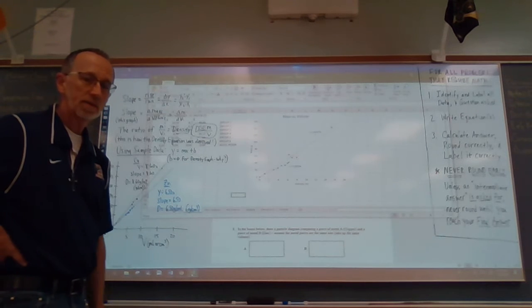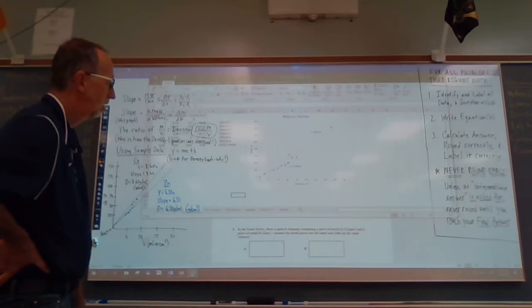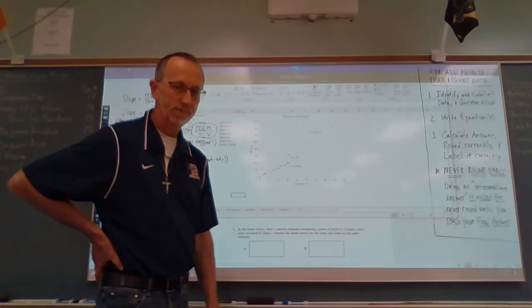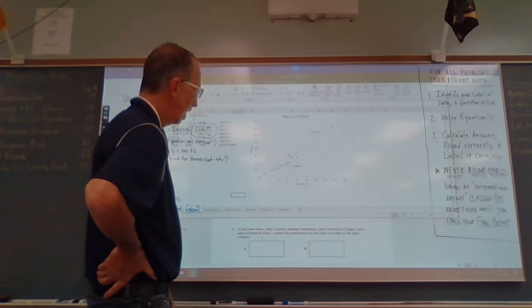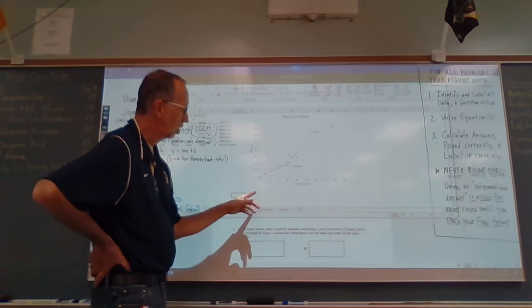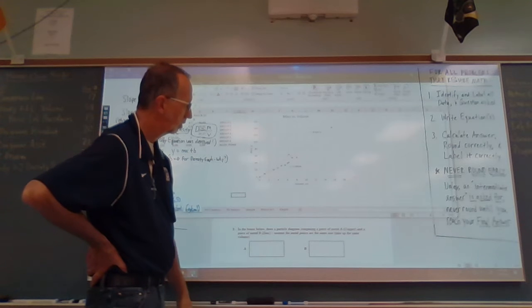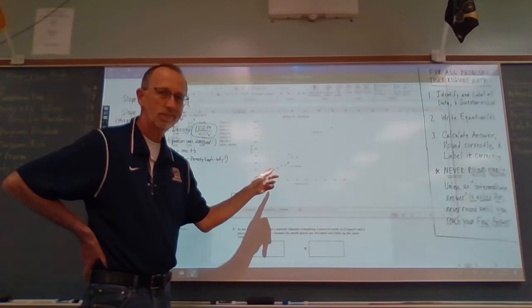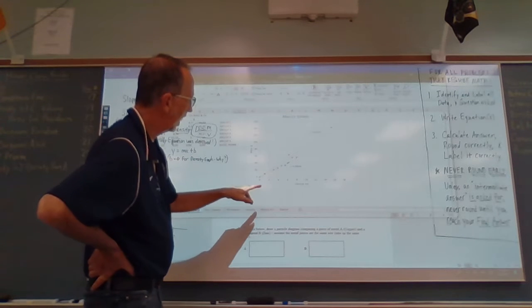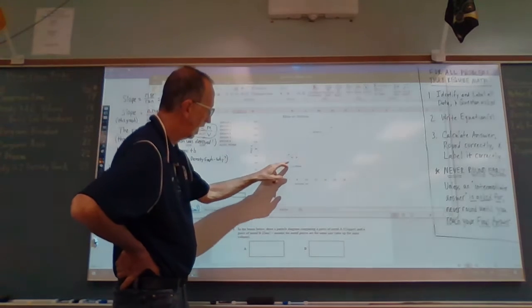Again, number 7 is 0, 0. And then when you plug that in and do the little Excel magic here, we get a graph right here. All right. And I have sketched that graph over to the side, so we'll look at that here in a second. But I wanted to show you that here in the orange color, nice, huh? Orange and blue. I didn't actually do that. It came up that way. So anyway, our orange data is for copper, and our blue data is for zinc.